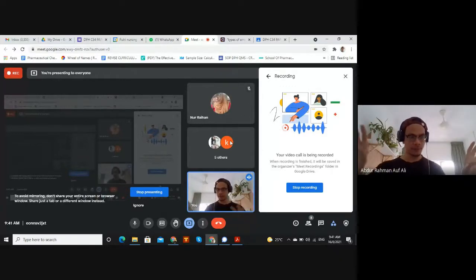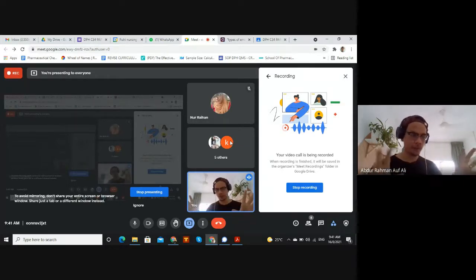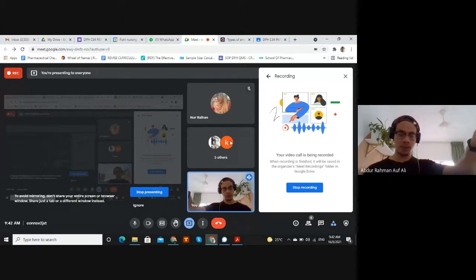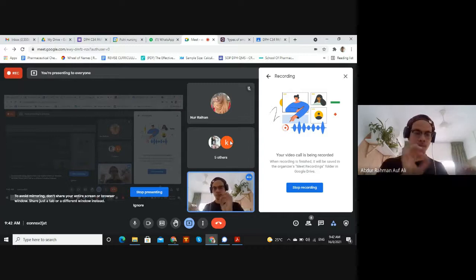So ada banyak faktor yang boleh menyumbang kepada kesalahan. So susah untuk kita buat investigation. So salah ni kepada orang yang buat mistake measurement menggunakan USP ke, dia orang JP ni salah guna chemical ke, orang yang buat test guna BP ni British pharmacopoeia menggunakan instrumen yang salah ke. So there's too many factors of error, sources of errors. So susah untuk kita buat, tak efficient lah kerja-kerja dalam makmal tu. So it will take a lot of days to pinpoint one problem.